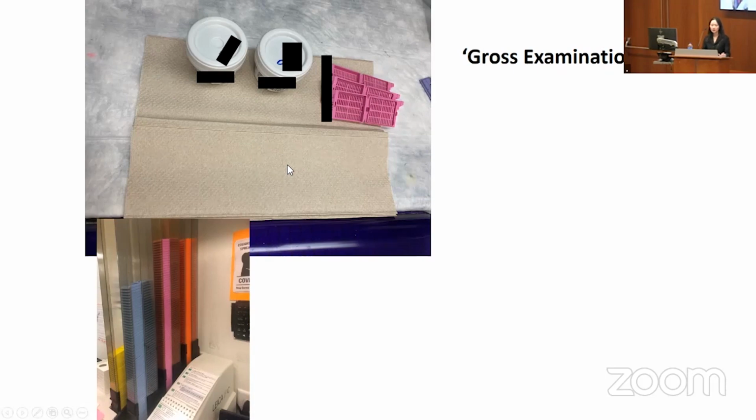So this is usually for us, a pathologist assistant, also abbreviated PA, but not physician assistant, pathologist assistant, even though we're also physicians. But they're specially trained to handle tissue specimens and to sample adequately. These are two jars. One has the core biopsy and the other has the clot section. The accessioner will print out these cassettes, which are little plastic containers with holes through them so that liquids can flow through and fix the sample.